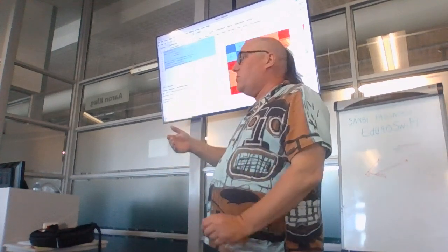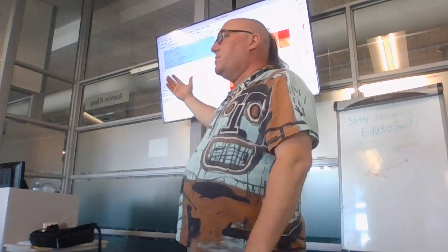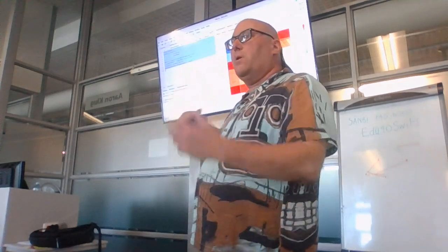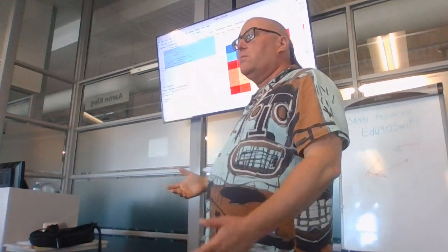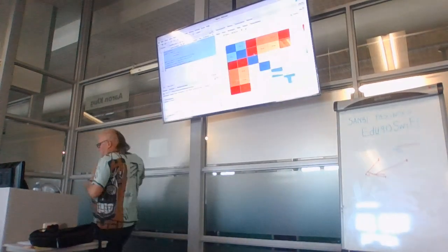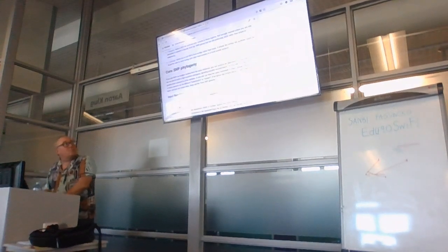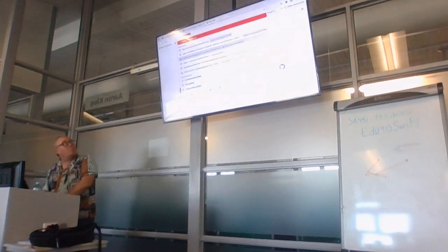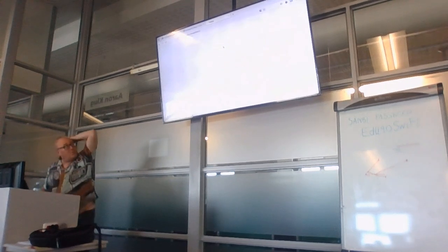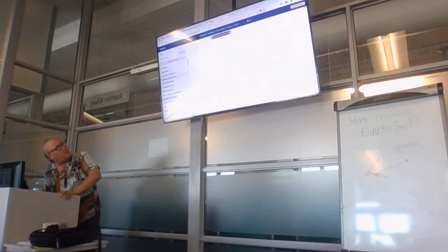But my point about this is just: don't stay in one world. Don't stare at text on a screen when you can use R to visualize your data for you so that you can understand it more easily. And if you don't want to do it in RStudio, you just switch to the right window here.